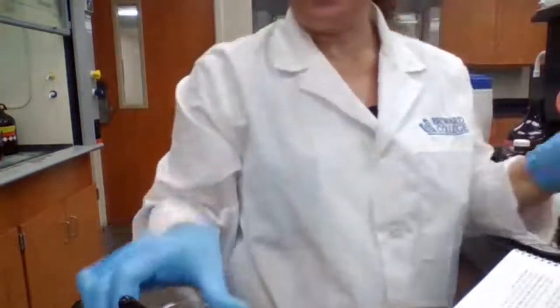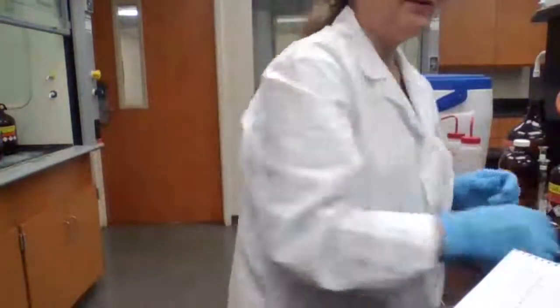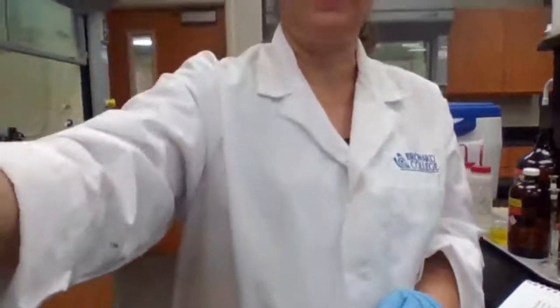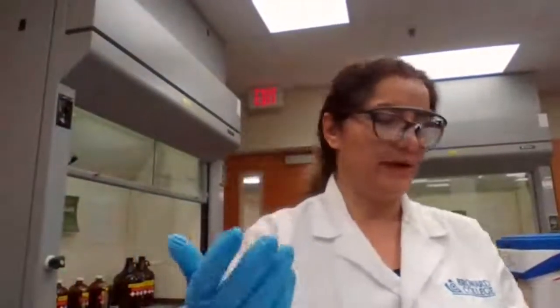Okay, we are done with experiment 1, or part A of the experiment. If you look at the balanced equation, you can make sense out of this. If I give you all the answers, then you don't have any work to do, and that's not the purpose of this remote learning. So you see the evidence of the reaction, you look at the balanced equation and see what is happening, and you record your observation.